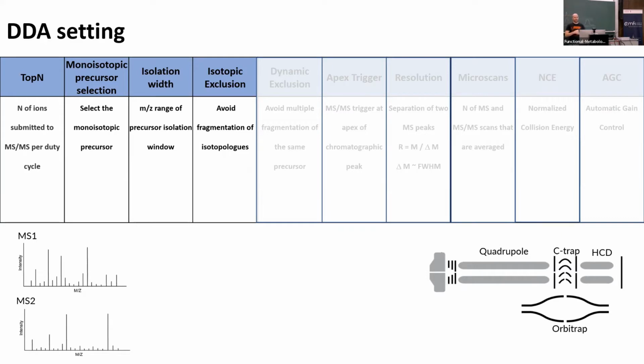Maybe if you look for, again, halogenated compounds, they become more important. Classic metabolite, you would have an isotope pattern like this, then you don't really need monoisotopic precursor selection. So then it's optional. It's more for certain compound classes or for larger molecules like peptides or proteins. I don't know, the one we have, you can select that. I don't know about Waters. So I think most instruments you would do proteomics with, they probably have a setting like that.